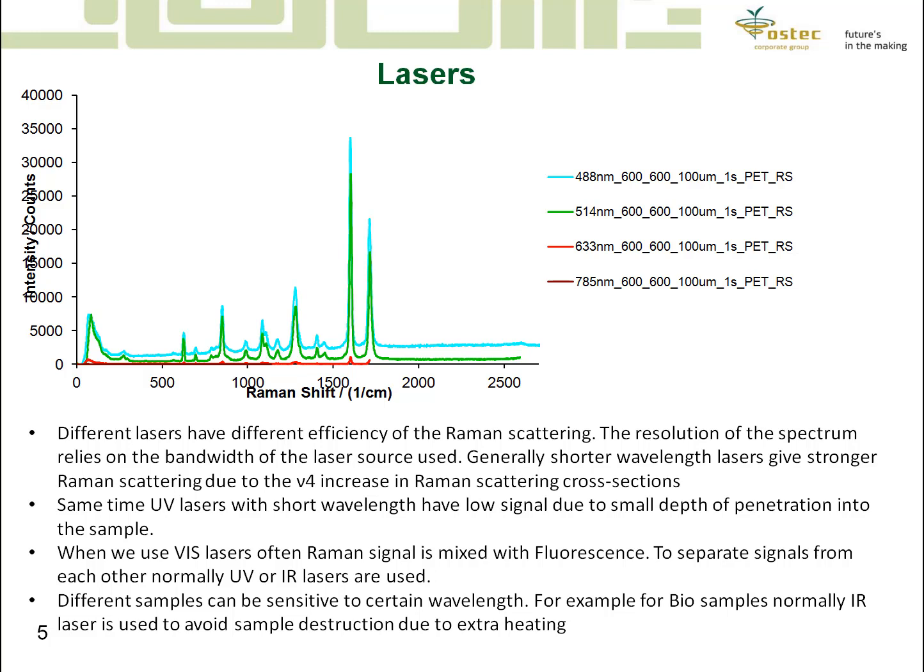Lasers are a very common light source for Raman microscopy, and they are very helpful because they have very strong power and a very narrow spectral bandwidth.